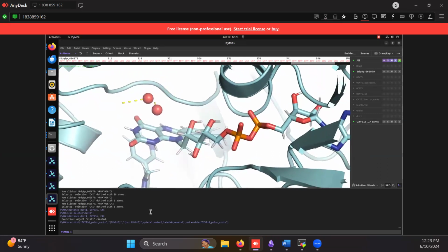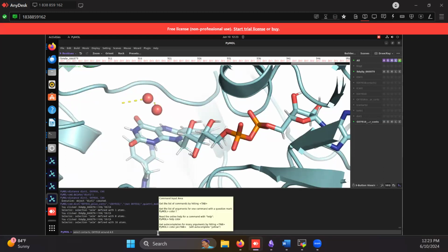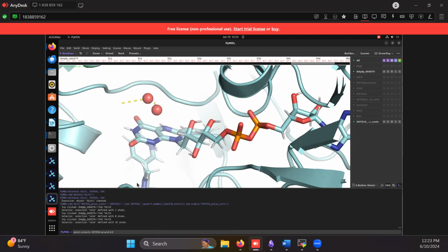But it does not make the selection for me. I might have to go and manually check, hey, where is this contact being made? So instead of doing that, what you can do is use the selection algebra. We said, hey, select contacts around 4 angstroms from oxy 916.